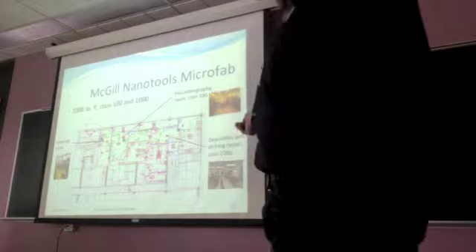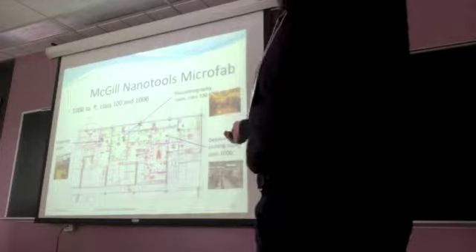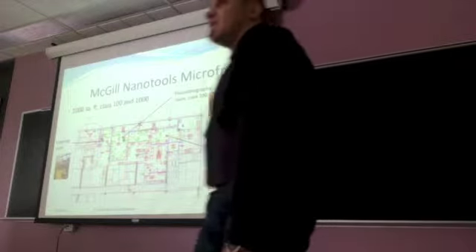And you can see that the light is completely yellow. Can you tell me why we use yellow light?